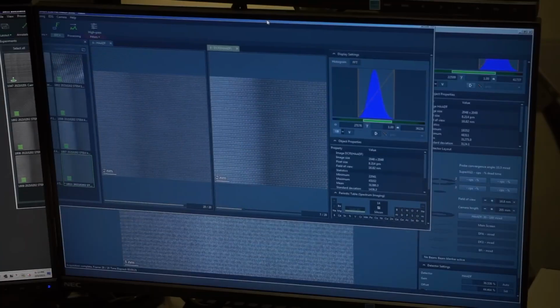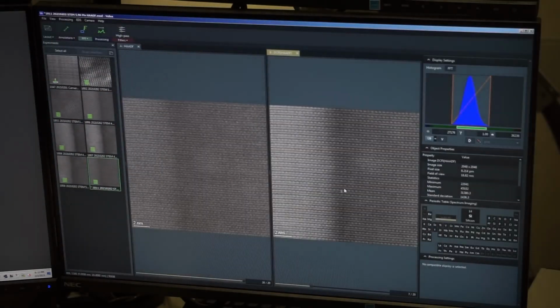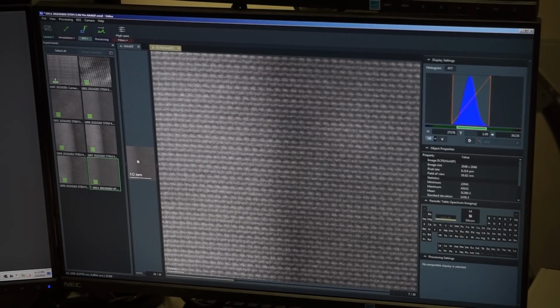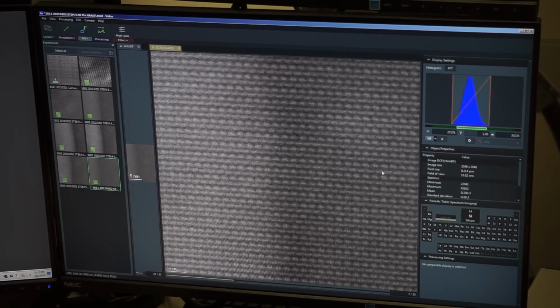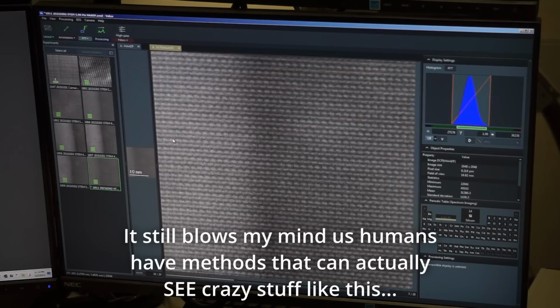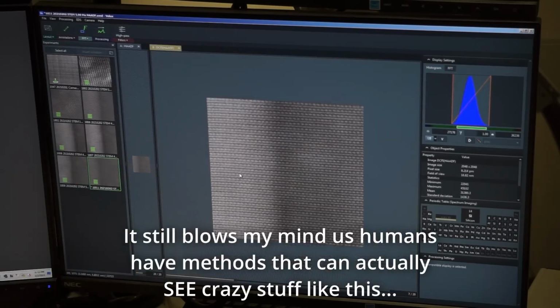and you need to correct for that. So tin selenide is this layered structure, so you can see, once we do a little bit of the correction here, this is two layers of atoms that are glued together, and then below it is two layers of atoms that are glued together, and then below it are two layers of atoms that are glued together. So you get this sort of double layer structure going through the whole material.